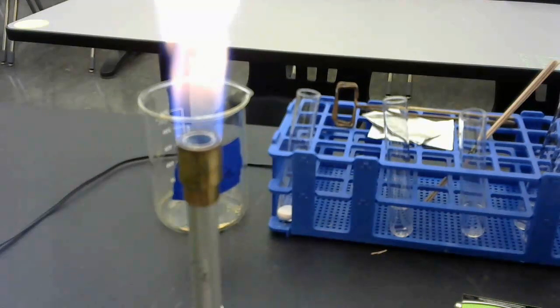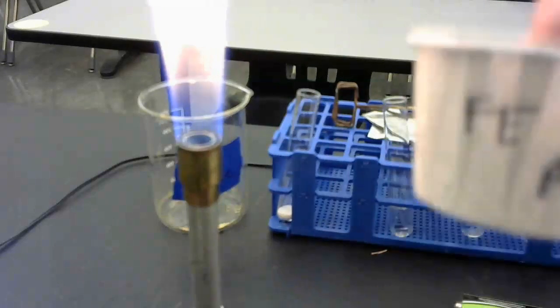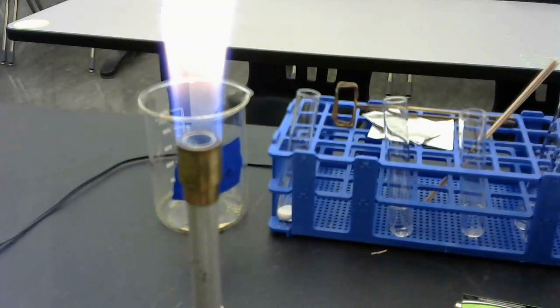The next one, lab station number 2, says slightly pull apart a piece of steel wool. Your steel wool is already pulled apart. That's your Dixie cup labeled Fe, okay? Fe, it's for A number 2, and this is your steel wool. And we're going to make some observations.